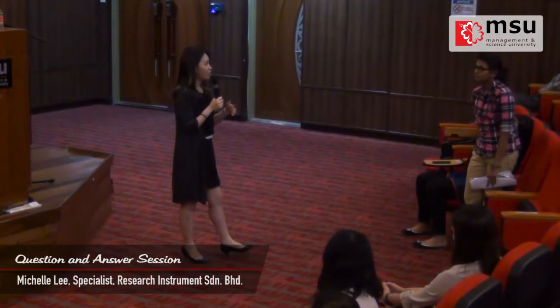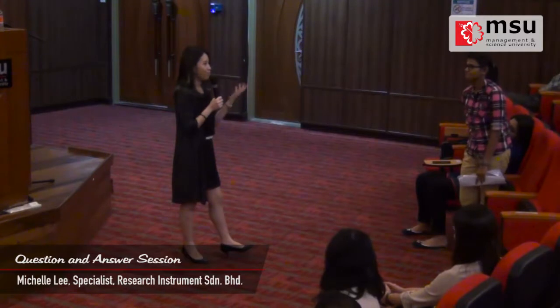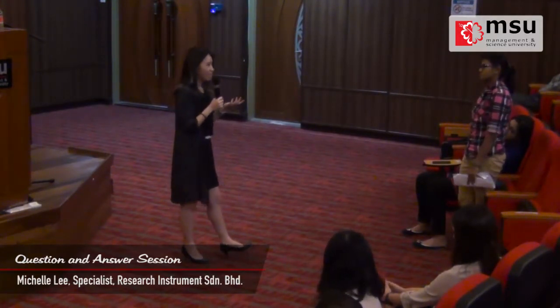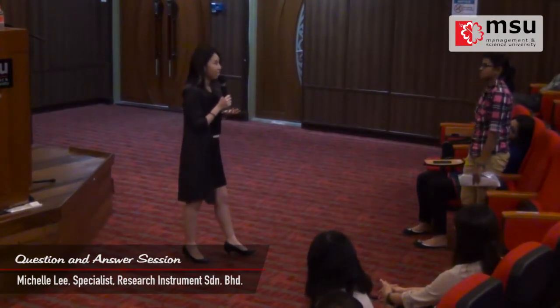I'm not sure whether higher concentration really means better quality. This I'm not so sure about. But I think that's the way it is. You can quantify the antioxidant. Alright? Okay?